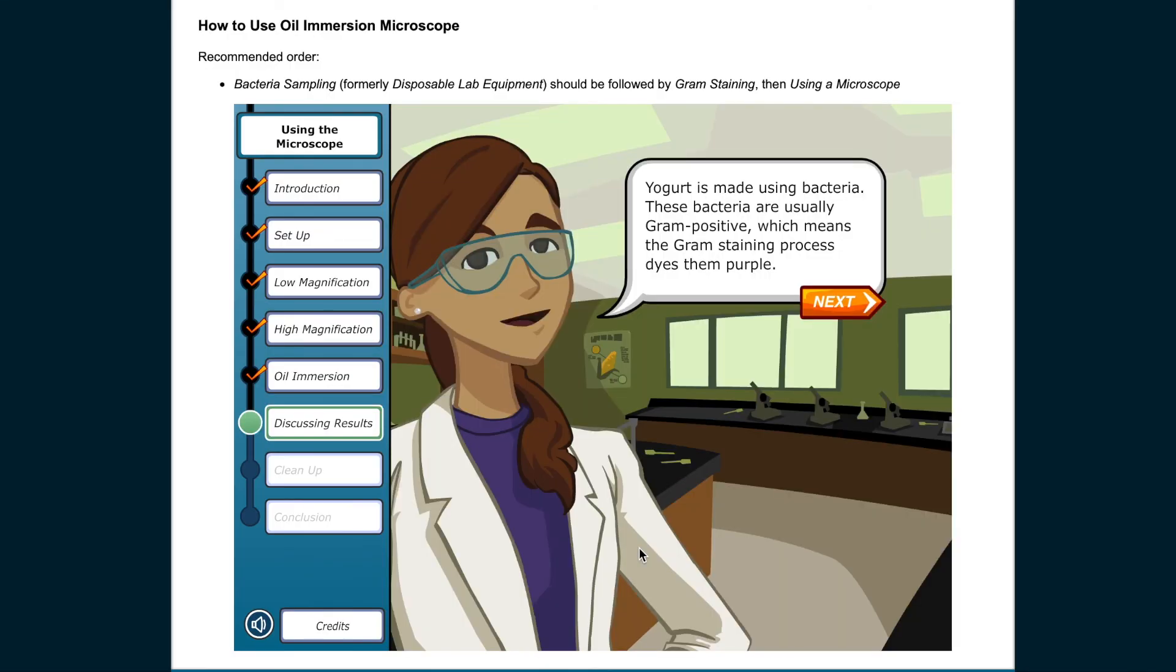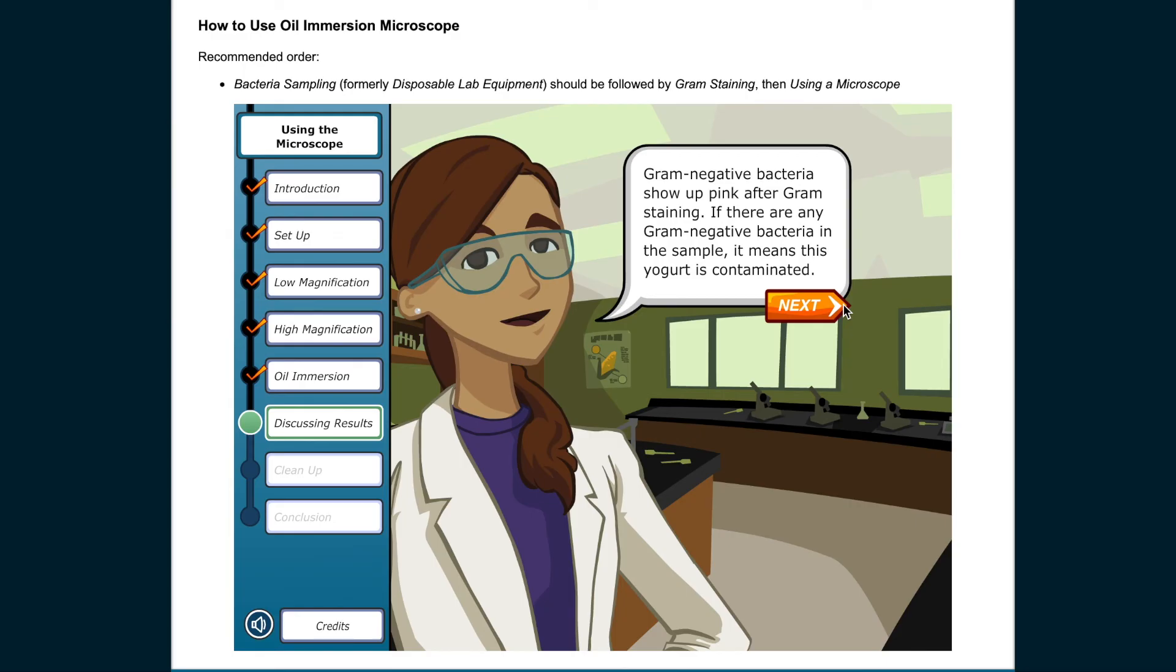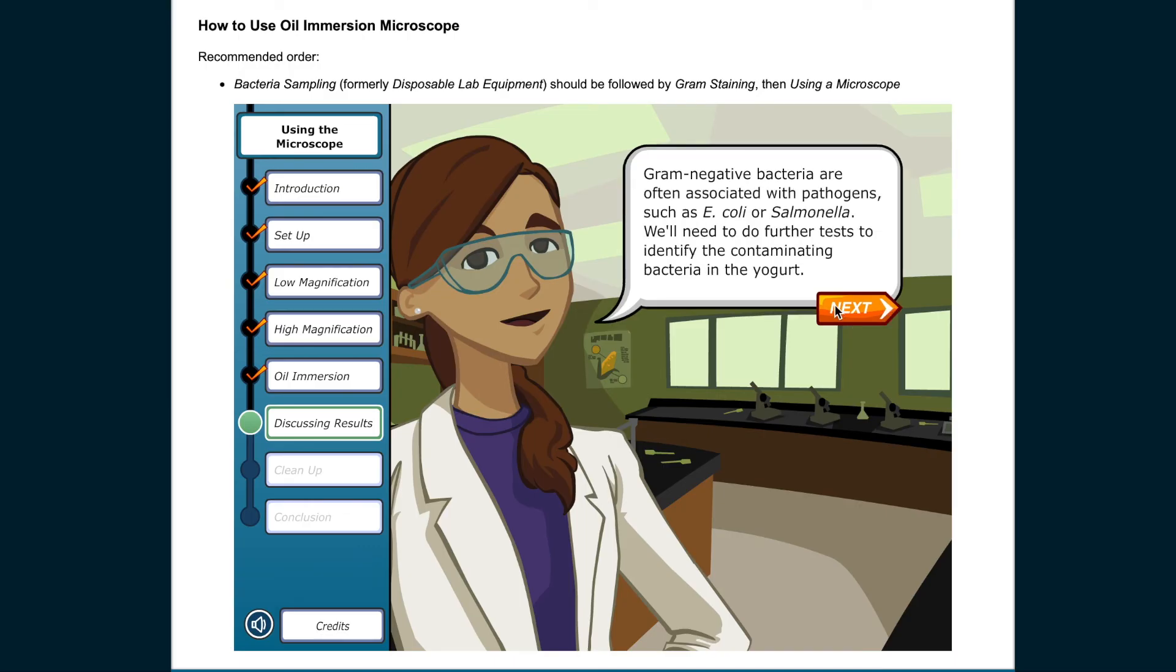Yogurt is made using bacteria. These bacteria are usually gram positive, which means the gram staining process dyes them purple. Gram-negative bacteria show up pink after gram staining. If there are any gram-negative bacteria in the sample, it means this yogurt is contaminated. Gram-negative bacteria are often associated with pathogens, such as E. coli or Salmonella. We'll need to do further tests to identify the contaminating bacteria in the yogurt.